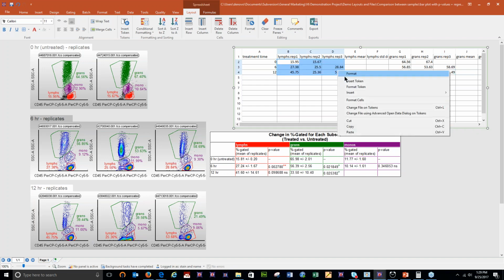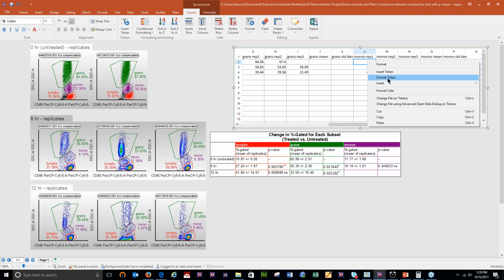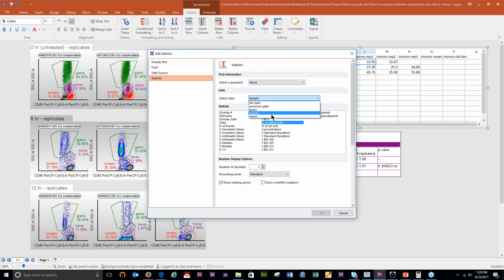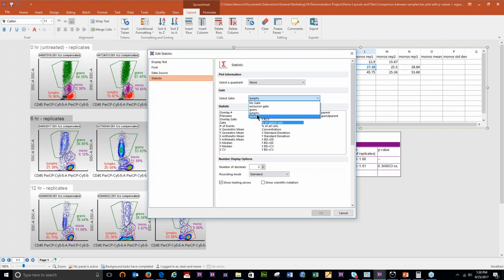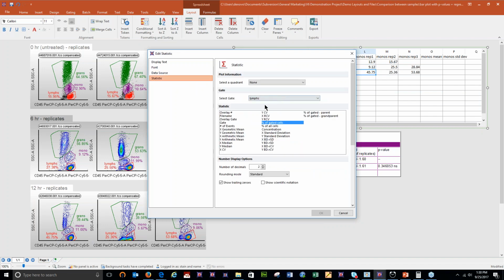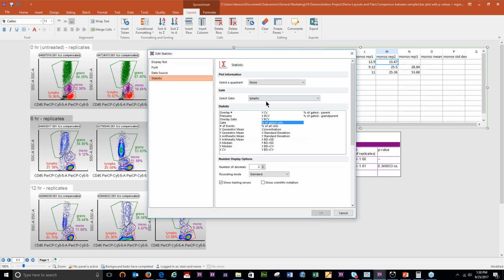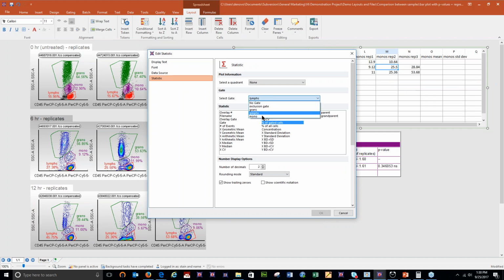Okay, and I'm going to go ahead and do that for the monos as well. So we'll paste, and I will reformat these. Okay, I'm getting there. The cool part's coming, I promise. I just wanted to go through the very beginning of building this with you, so you'll see that I have nothing up my sleeve. So thanks for sitting through this with me.